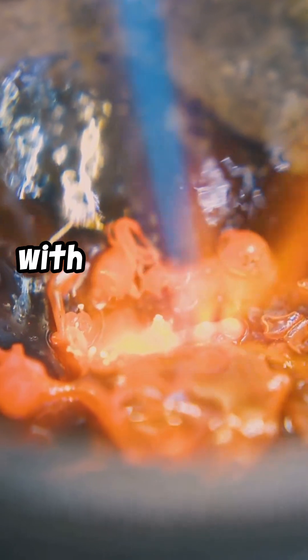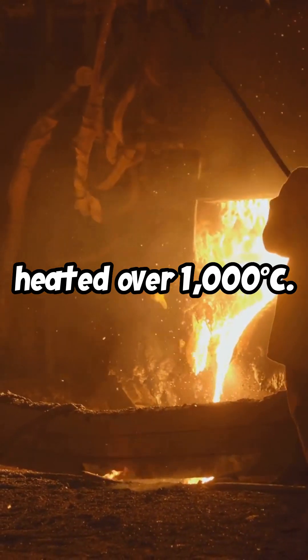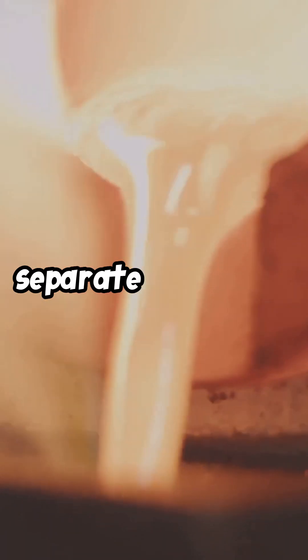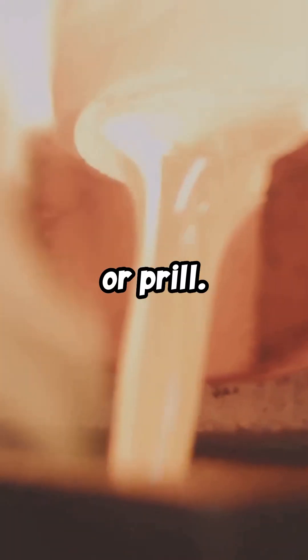Next, we mix this powder with flux — a combo of borax, silica, and soda ash. This mix goes into a crucible and gets heated over 1,000 degrees Celsius. The heat makes the flux liquefy and separate impurities from the gold. The heavier gold settles at the bottom as a bead or prill.